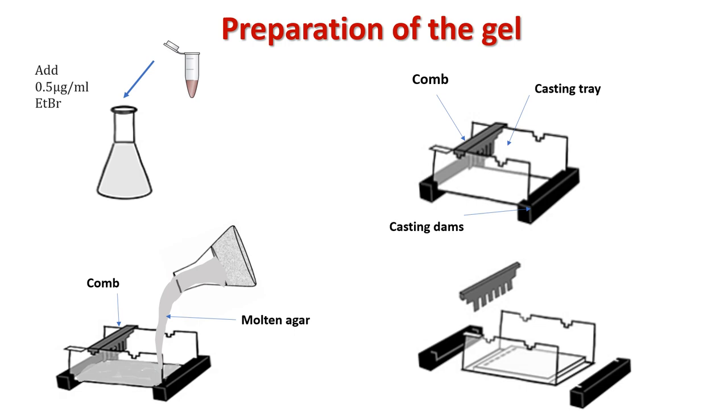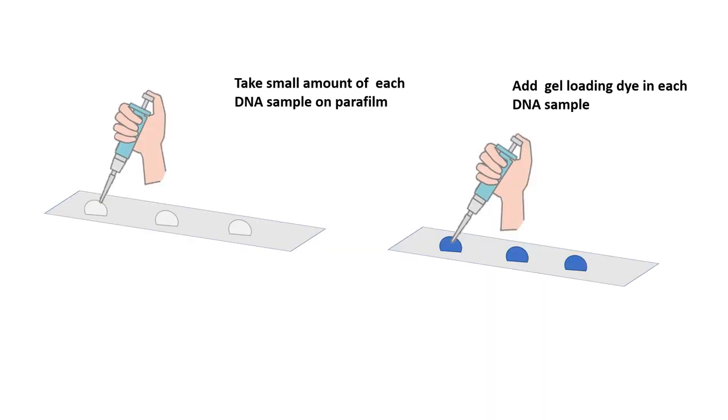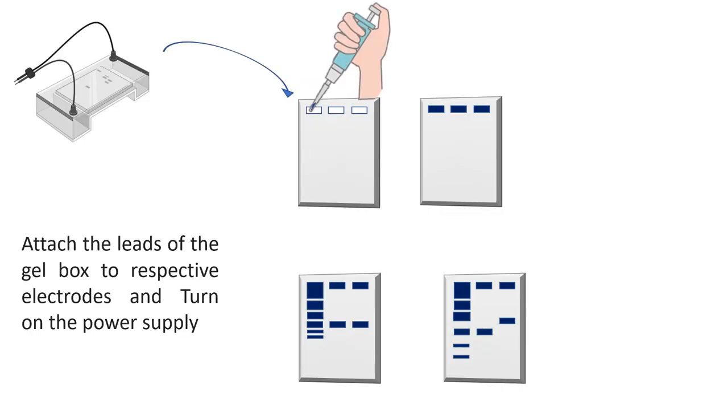Add running buffer to the tank to cover the gel surface. Take a small amount of each DNA sample on parafilm and add gel loading dye to each sample. Slowly and carefully load the DNA samples into the wells of the agarose gel. In the first well, add an appropriate size DNA marker, which acts as a reference for DNA bands. Attach the leads of the gel box to the respective electrodes, turn on the power supply, and run the gel until the dye has migrated to an appropriate distance.